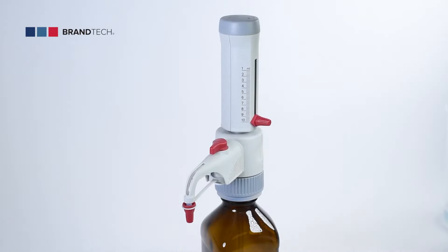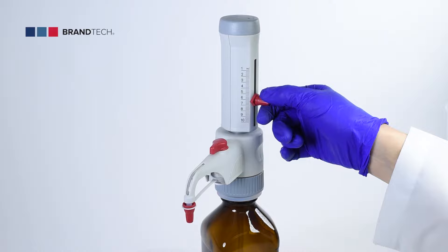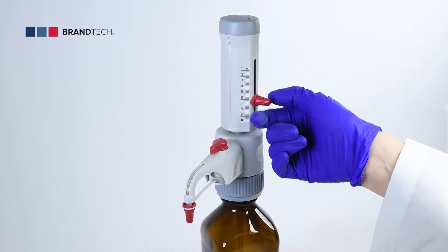To adjust the volume setting for the analog adjustable model, loosen the volume selector thumbscrew, slide the pointer to the desired volume, and re-tighten the thumbscrew.